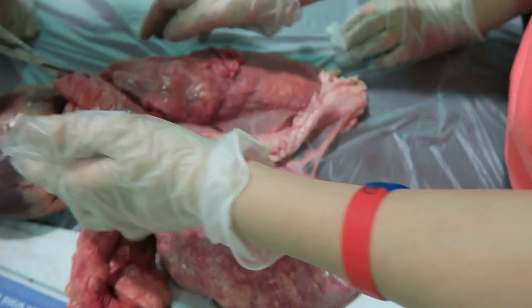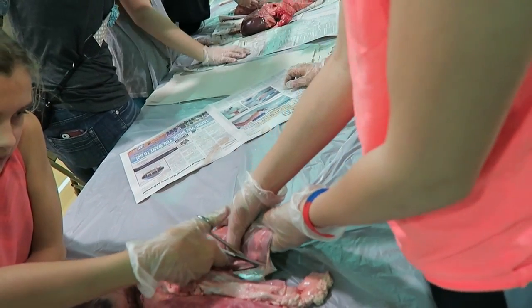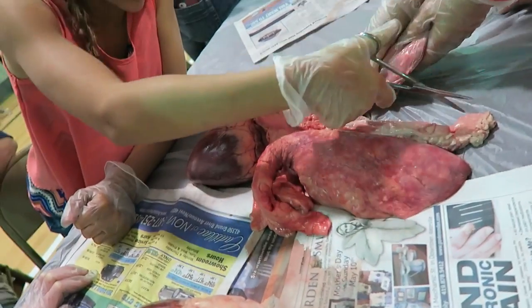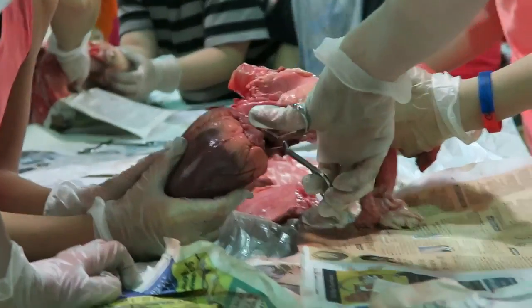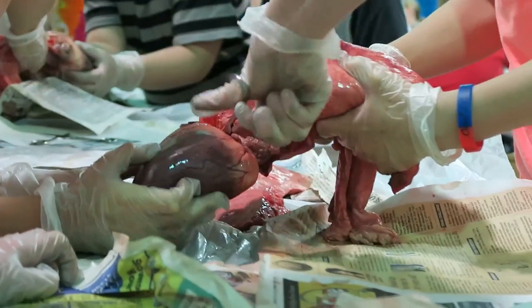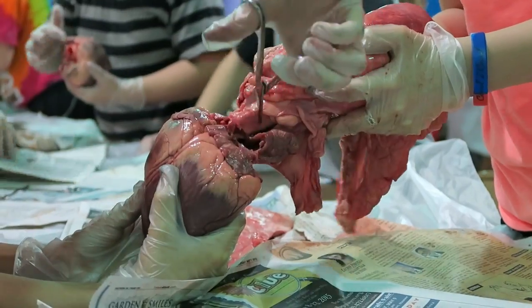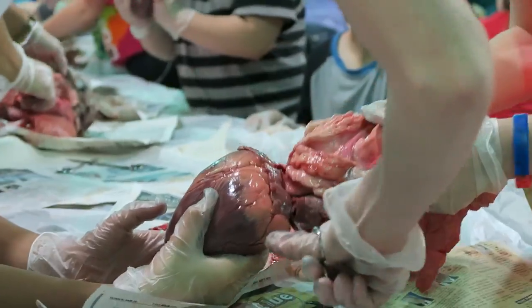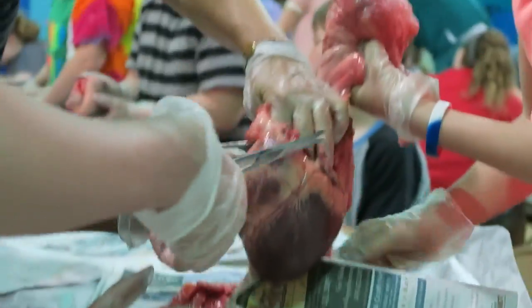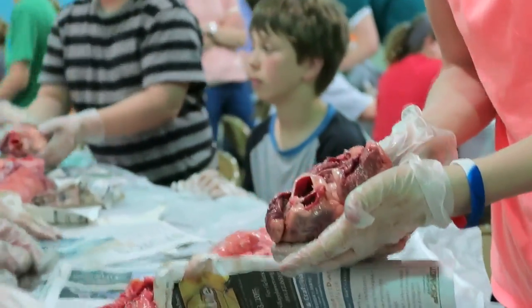Cut down the hole. Yeah, you've got to cut all the way through. If you were a surgeon, your patient would be dead. Watch your fingers! It's so hot. Hacking it. Hopefully you're not doing surgery on me somehow. I don't like it.